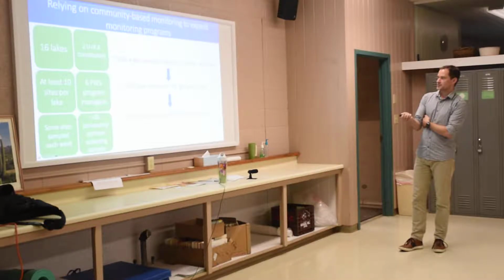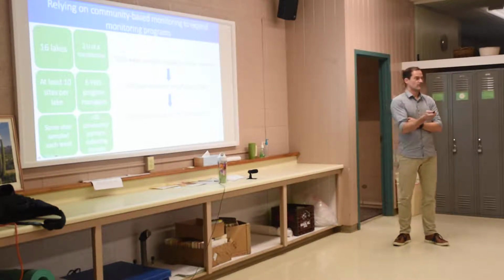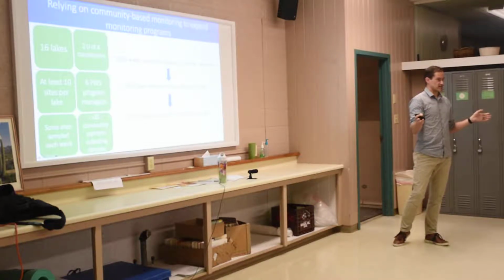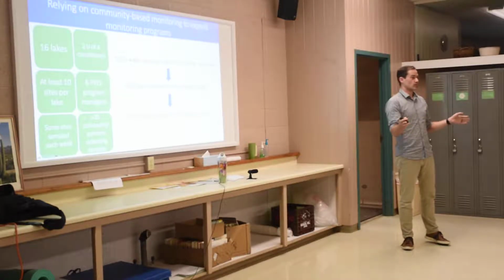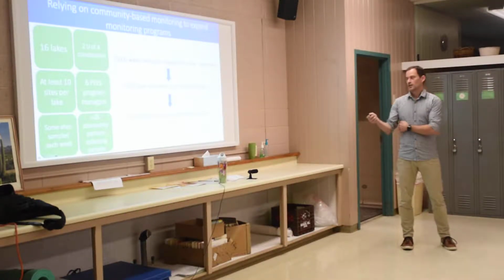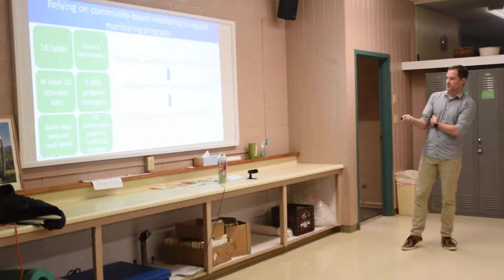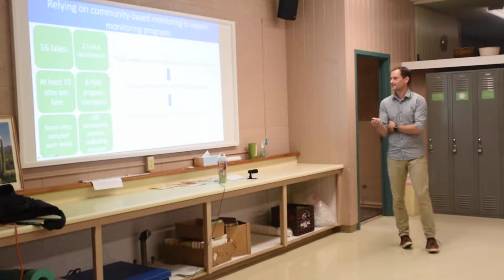And that means that Ron is going to have to run in his Freshwater Solutions lab over 1,000 of those general schistosoma assays. And then what we're going to do is we're going to take the ones that are positive for any schistosome, and we're going to run a species-specific test on it. And we're going to run all species-specific tests that we have, all 5. That means that we run over 5,000 species-specific qPCR tests at our lab in the University of Alberta. We've run about 2,500 already, I think.